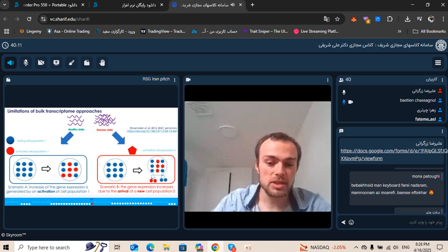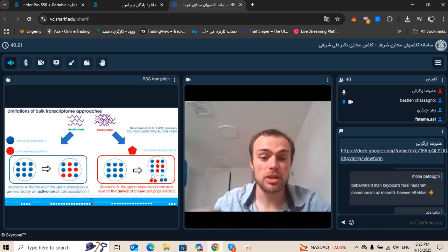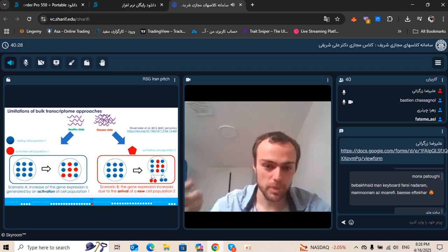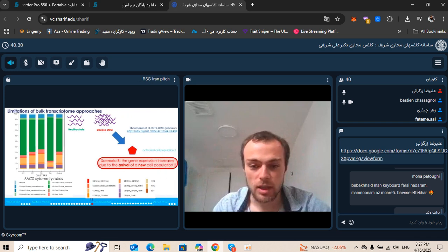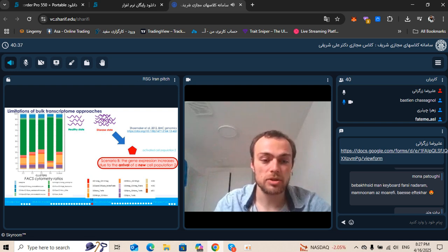Another equal hypothesis is to consider that you have a change of cell composition with the infiltration of a new cell population. And it is this new population that releases in much higher amounts the gene expression that has been changed across conditions. And actually, this is what certainly occurred, and this is what certainly characterized best the clusters. So not native changes of expression, but rather changes of cell composition.